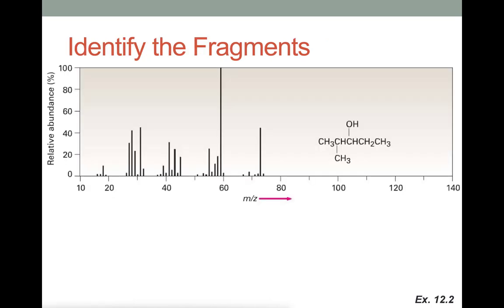So here are some pieces. Here's a spectrum from this alcohol. So identifying the fragments. Well, if we add all of this up, 1, 2, 3, 4, 5, 6 carbons, that gets me to 72. The oxygen puts me already higher than this. I'm not actually seeing the M+ peak, but what I am seeing is the dehydration and alpha cleavage products.